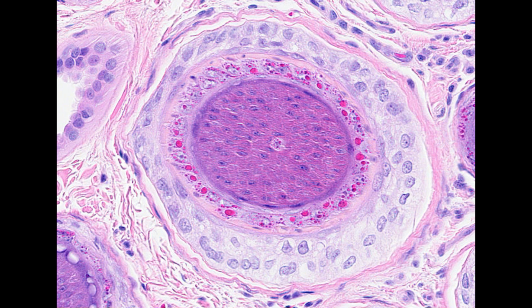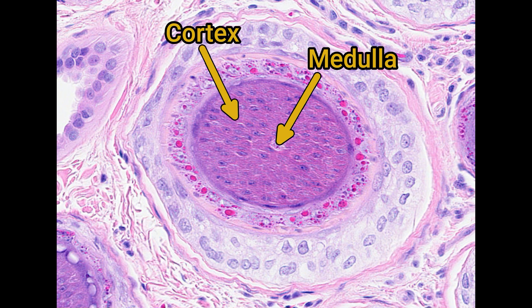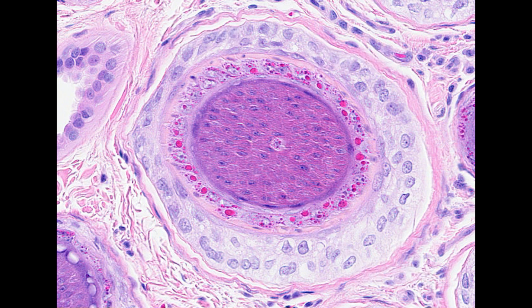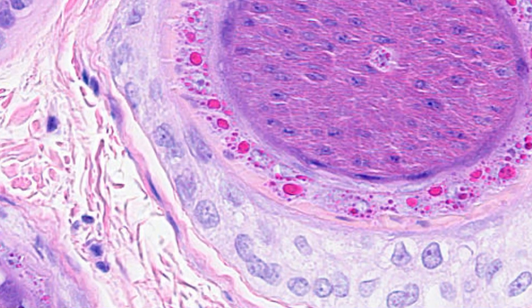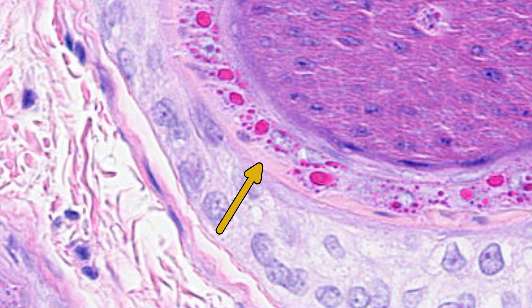Moving further up the hair follicle, the cells are differentiating even more. The medulla of the hair shaft is now a tiny portion with the cortex forming the bulk. The cells of the cortex are producing keratins, turning their cytoplasm more eosinophilic. The cells of the cuticle have flattened and are forming a more convincing barrier. Meanwhile the inner root sheath looks similar, but a hyaline eosinophilic layer appears at the margin between the inner and outer root sheath. The inner root sheath is formed of two cell layers: Henley's layer and Huxley's layer.